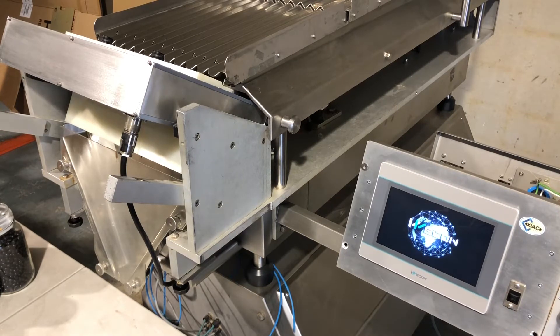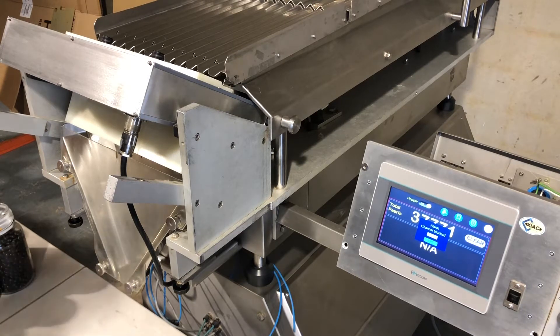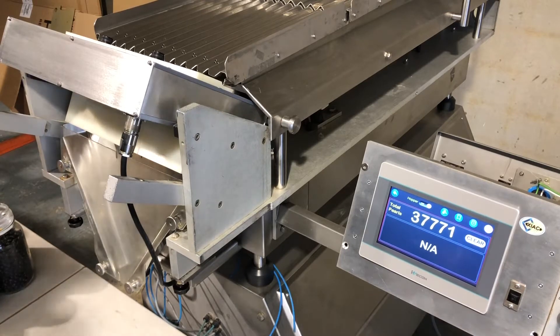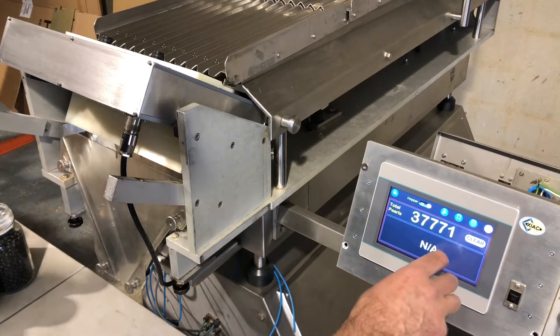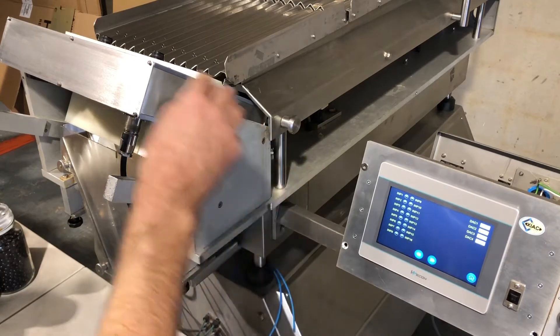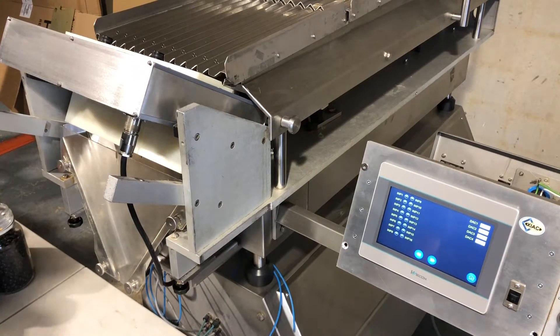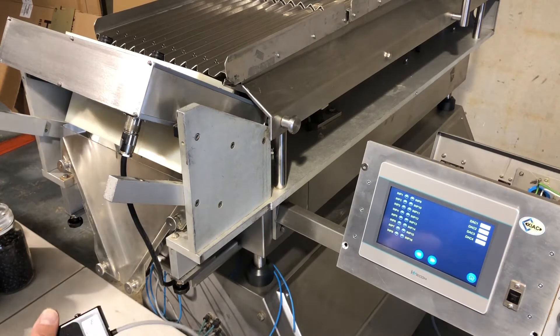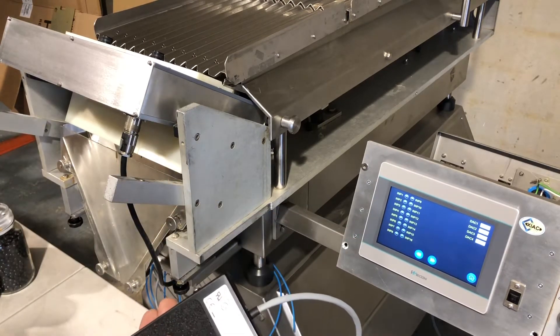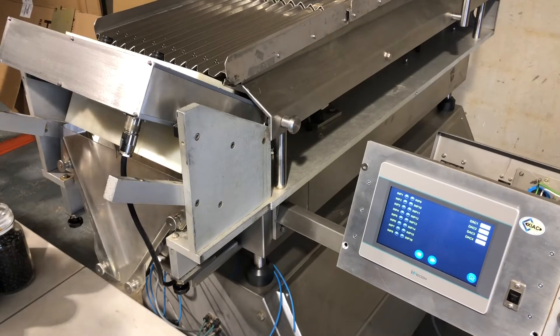Now the first thing we do is check if everything works. We are going to check these 12 inputs for the counter and then input 16 for the foot switch. If I press the foot switch, you can see here input 16 turns green and the counting channel should do the same thing.